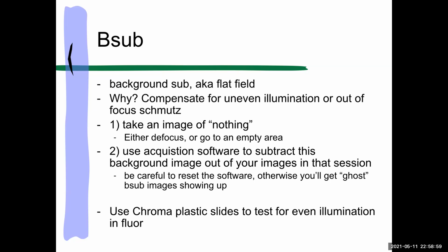It's a Yiddish word for, let's just nicely say, dirt. And it's like that little fiber from your clothing that landed in with your specimen, or generic junk, you don't know what it is, but you can tell it's not your specimen, but it's always right where you want to image. Schmutz has a way of finding a place in your image.